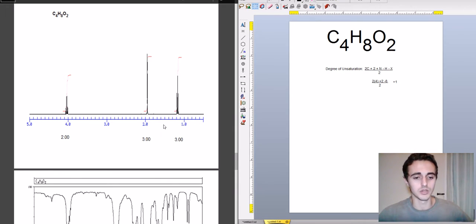So now let's go to our NMR. After doing a lot of problems, you'll be able to solve these using only your NMR. IR will just be for checking your work, but let's go through it step by step now. Over here on the right is upfield, and the left here is downfield. You end up downfield when you're next to something electronegative, something that's going to deshield you and mess with the spin of the hydrogens. Your NMRs will tell you the environment that those hydrogens are in. Again, hopefully your professor goes over it in more detail. I'm just going to tell you how to solve these.